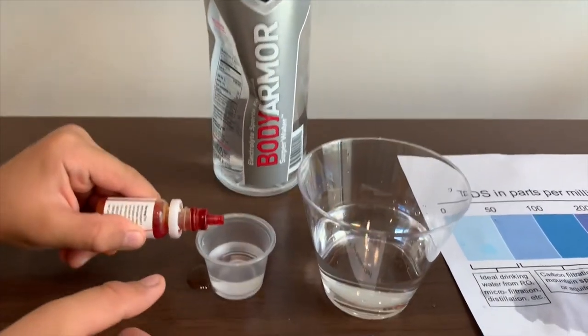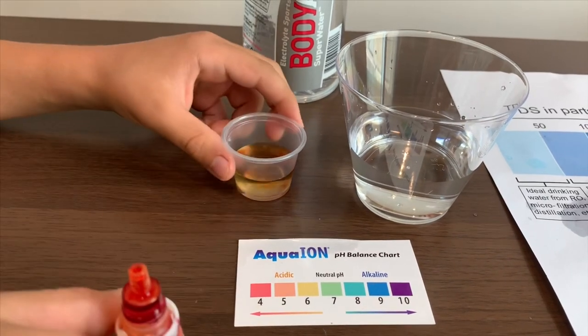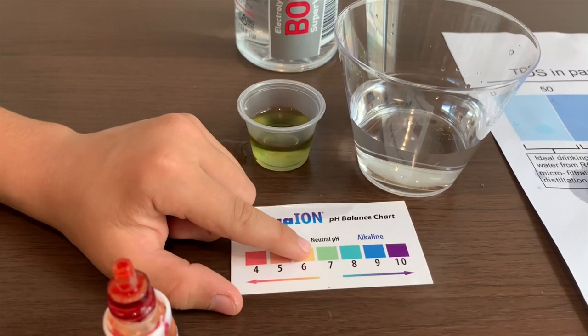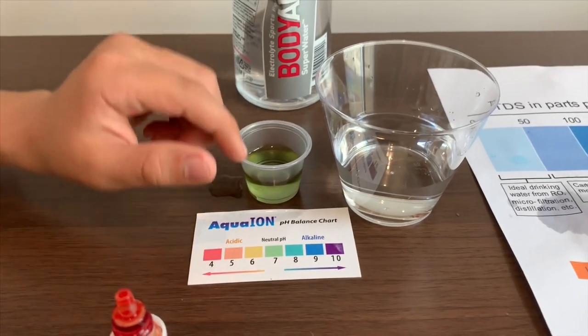I need to do two drops. It is around seven — that means it's a neutral pH.